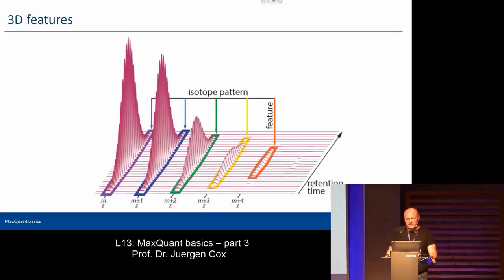Yeah, so the mass accuracy, I mean, you will actually hear more about the hardware itself and its properties on Friday. So there's a talk by Scarlett Beck from Bruker, who's actually saying a lot about these things and hardware properties. The mass accuracy, of course, you also have to apply a nonlinear recalibration here to achieve high mass accuracy.